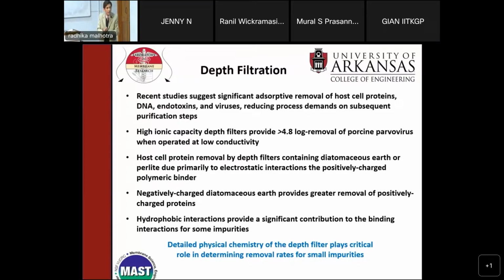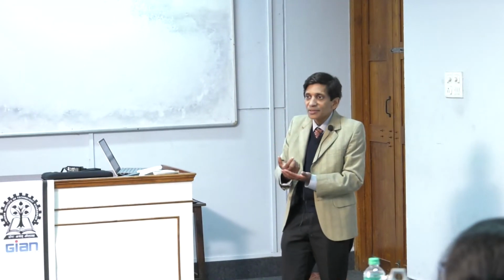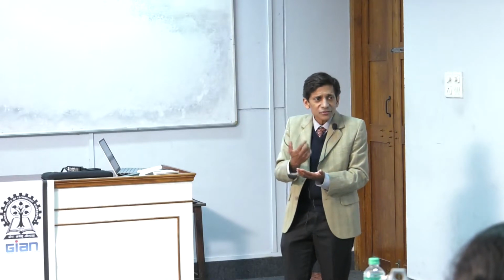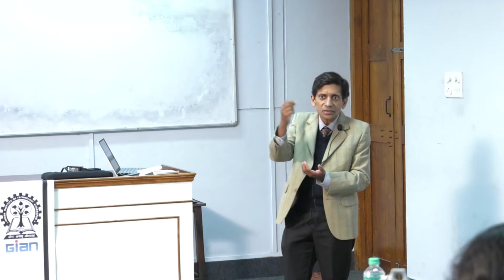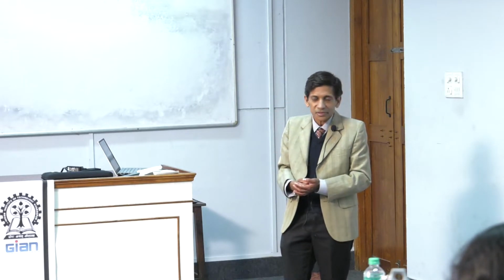So typically we bind quaternary ammonium groups, right, to remove by charge, ion exchange. We bind sulfonic groups for cation exchange, anion exchange, and so forth. But multimodal ligands, where you have, say, tertiary amines or primary amines, are interesting because then you can have charge, but you can also, on the other functionalities, put hydrophobic groups on them. So this is something that's of great interest these days in coming up with these multimodal ligands.